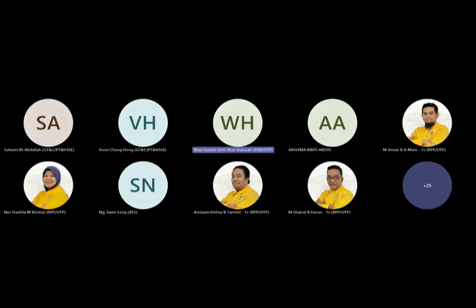Madam Katrina, one question from Dr. Nozatushima: is REE only suitable to trace using ICP-MS? Yes, ICP-MS only. Because in ICP-OES, rare earths have a lot of wavelengths, and there is much more wavelength overlapping.